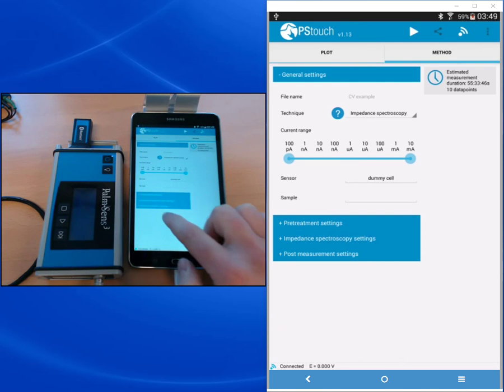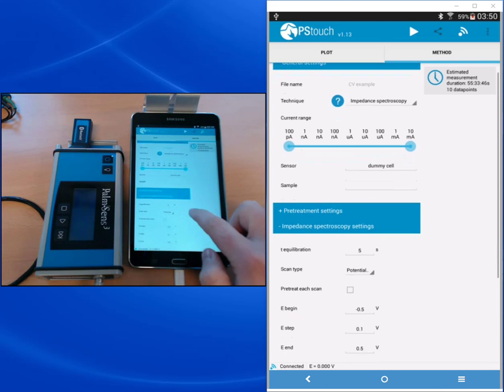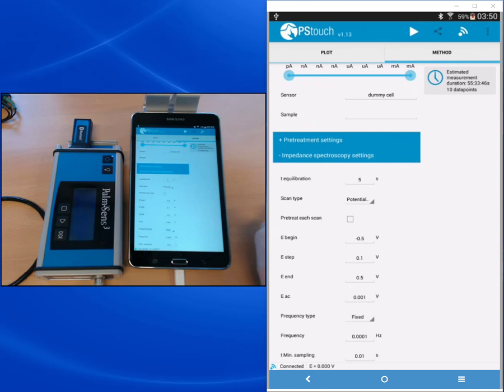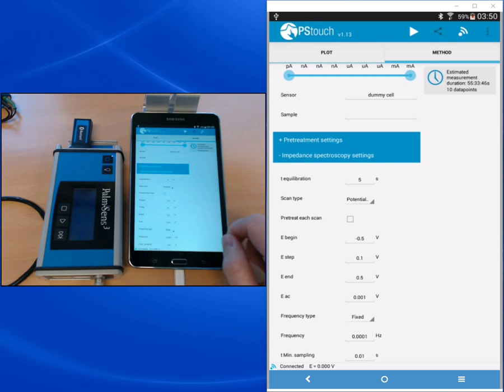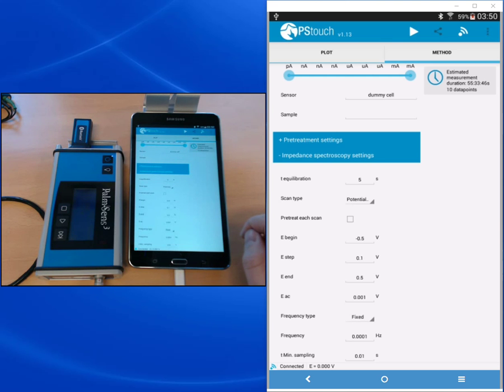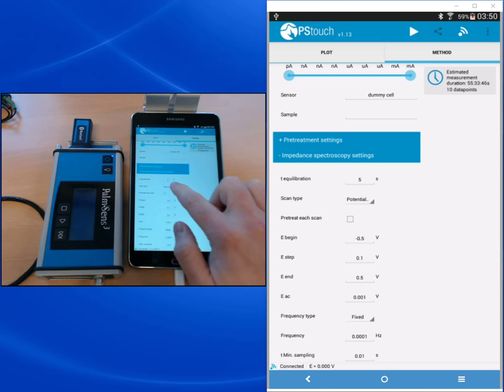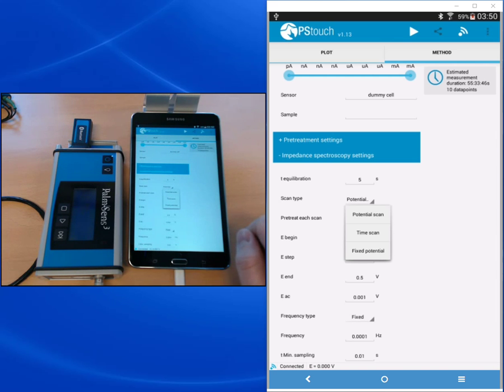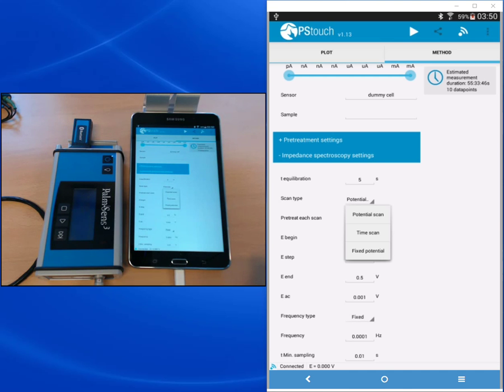Now we look at the impedance spectroscopy settings. The first one is the equilibration time which is at five seconds, and for a demo circuit this is more than enough time for any capacitive current to decay. The next point is scan type. We offer three different scan types. We offer the potential scan where you can repeat your impedance measurement for different DC potentials. This might be useful if you want to look for the right potential for your proper impedance spectrum. Usually the OCP is chosen or values close to it.